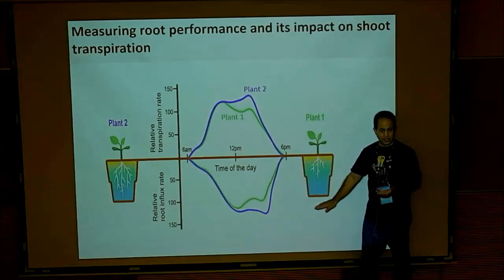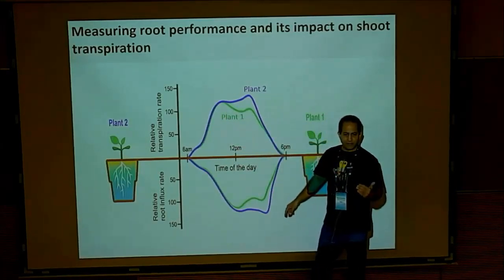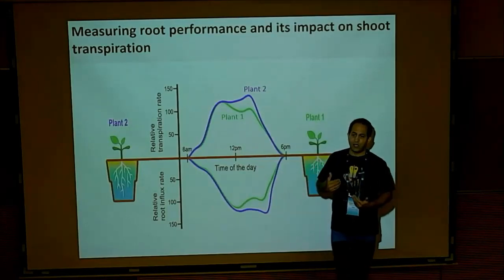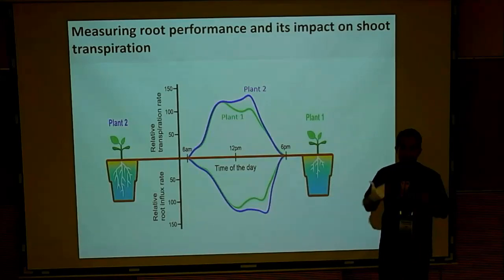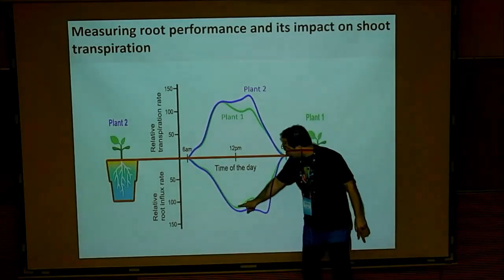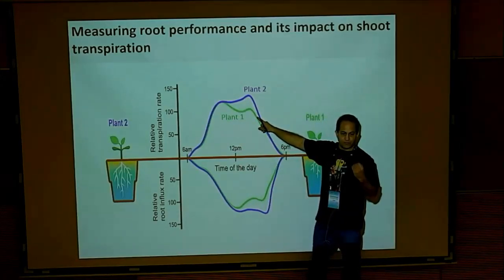Each plant is sitting on a scale. But it's not identical. Actually, we prove in a Plant Physiology paper that when you graft a plant on roots with lower function, we use aquaporin mutants that we know have lower water conductance. So water conductivity limitation of the root immediately limits the transpiration.